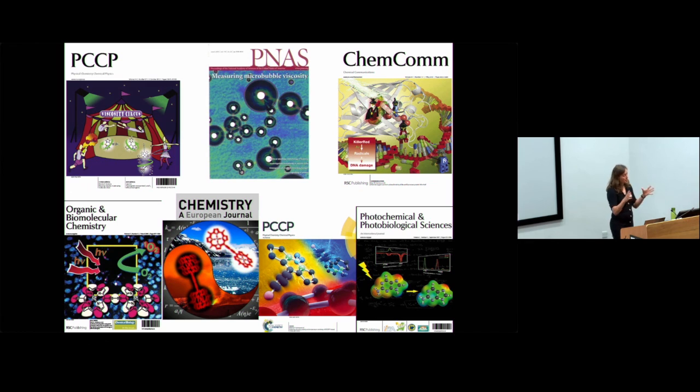It's a really good question. So we modeled our Halo tag rotor construct, and you can have Halo tags of different lengths as well. What we made sure of is that the rotor doesn't stick on top of the protein. We had cases when the rotor just quenches because it interacts with one or two amino acids just outside the binding pocket of the Halo tag, and then it doesn't measure viscosity, it measures interaction. So our dye sticks into the aqueous environment because the tail is really short, and it measures the viscosity of the aqueous environment of the mitochondria and ER.